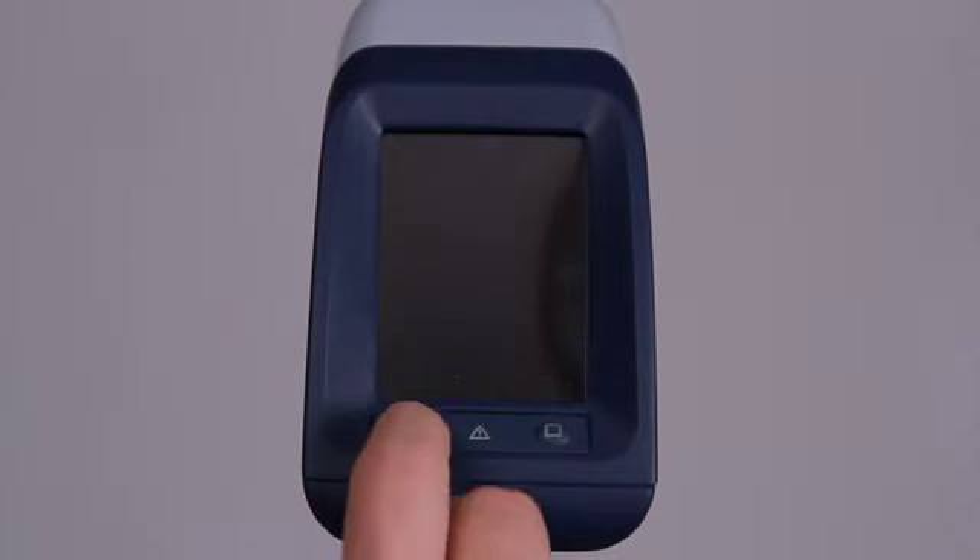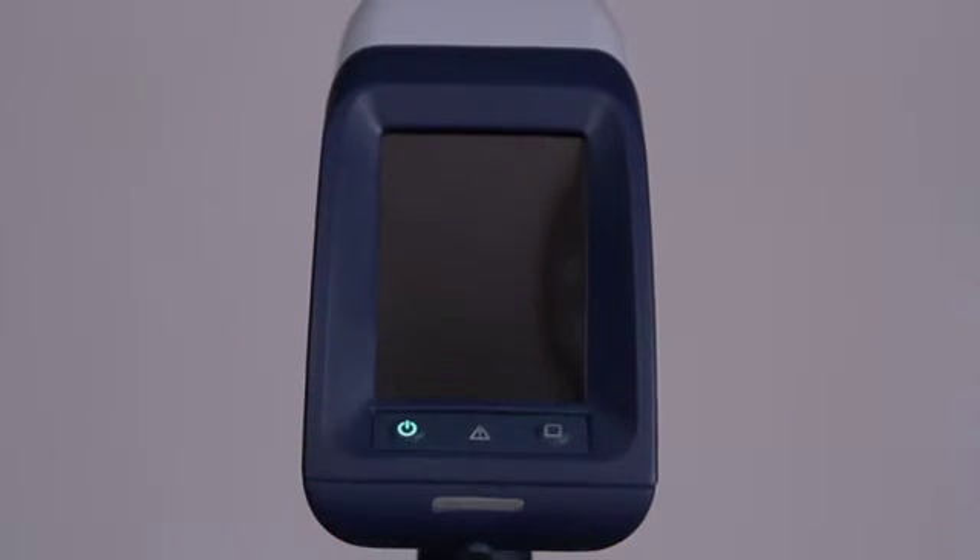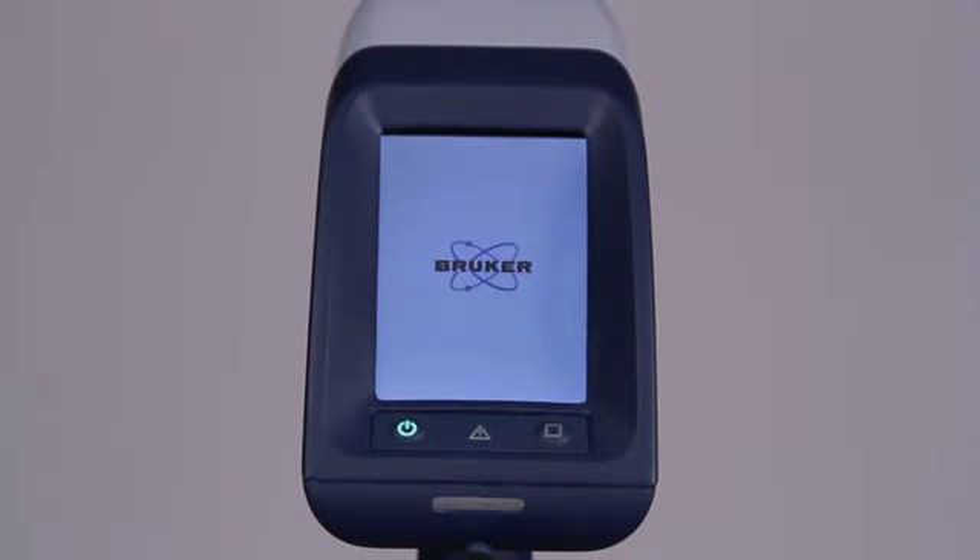The control panel of the analyzer is made up of two buttons, plus an infrared or IR proximity sensor LED. The left button is the power switch. To turn on the unit, press the power switch. The instrument will take several moments to initialize. To turn the instrument off, press the power switch again.